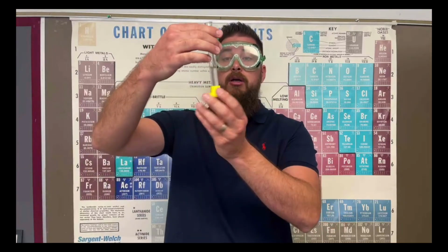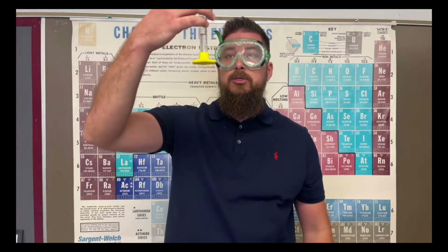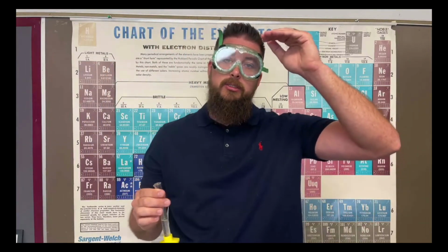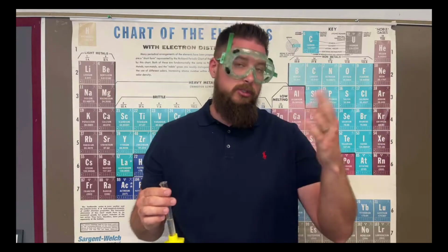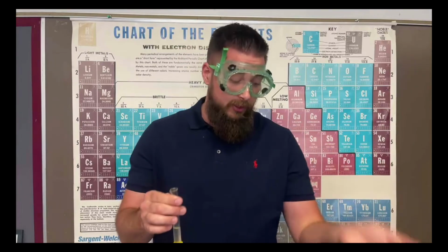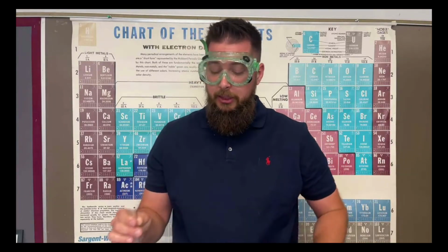Now this started off at 10 milliliters and now it says it's about 6.5 milliliters. Because we started off at 10 milliliters and now there's 6.5 milliliters, we subtracted and we get about 3.5 milliliters of this for that to turn pink and stay pink.